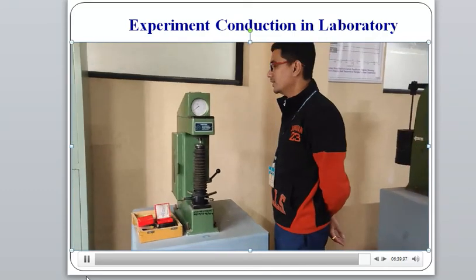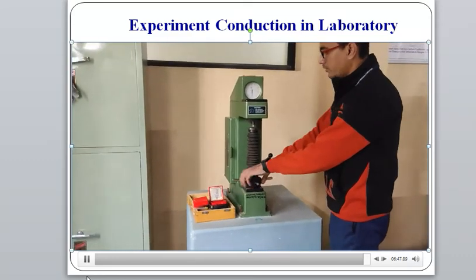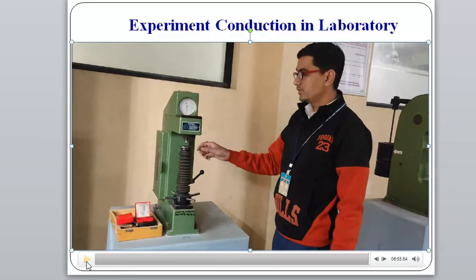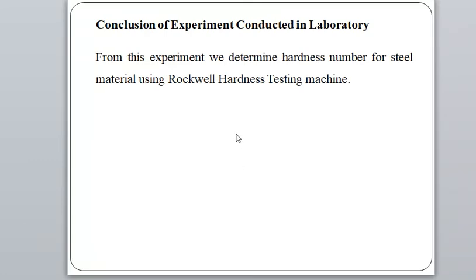The hardness value observed from the dial scale is 65 RC for the first reading of the steel sample. The height of the work table is then decreased and the sample is prepared for the next trial. Conclusion: From this experiment, we determined the hardness number of steel material using the Rockwell Hardness Testing Machine in the actual laboratory.